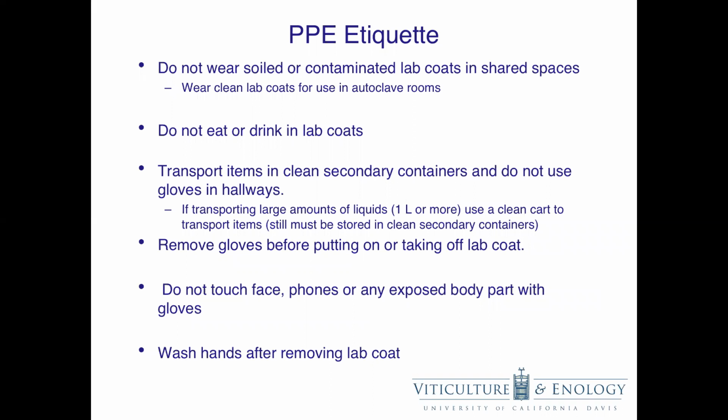Remove gloves before putting on or taking off lab coats. I have seen people touch biohazardous materials or chemicals with gloves, remember that they need a lab coat, then put the lab coat on with those same gloves. Doing this contaminates the inside of your lab coat and therefore any part of you touching the lab coat.